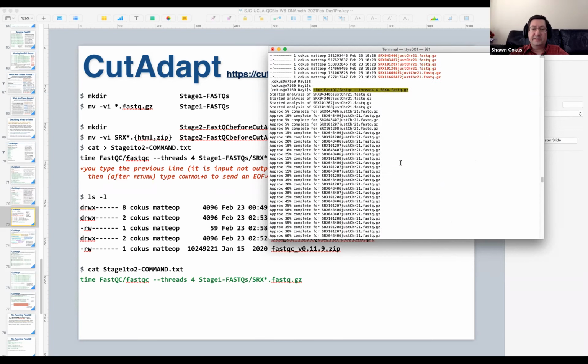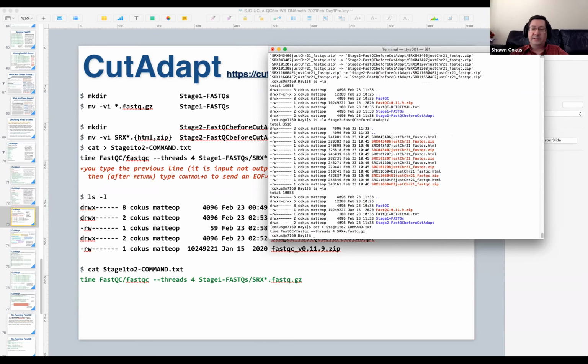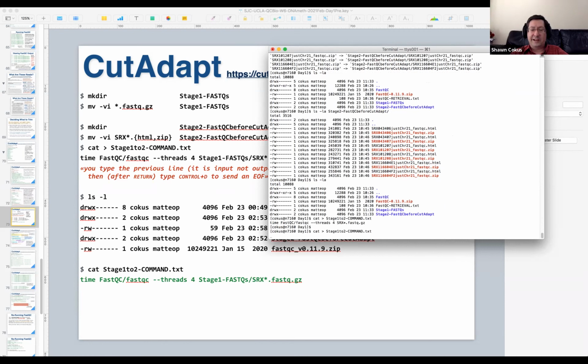That was the command we ran. So this is what we ran. Now that's not quite right because we moved files around after that, so that command isn't quite right. So maybe we'll lie a little bit and edit our log of what we did to make it a little more consistent with the way files are now.